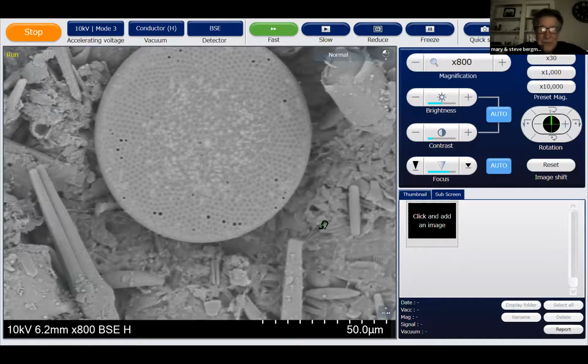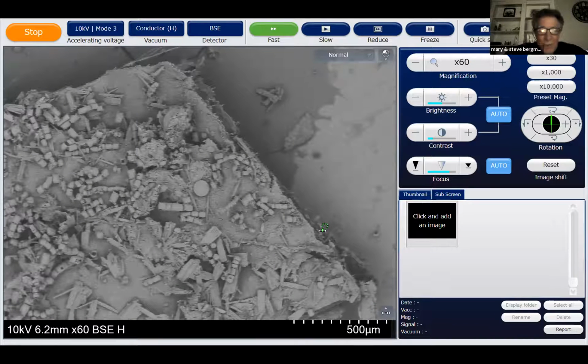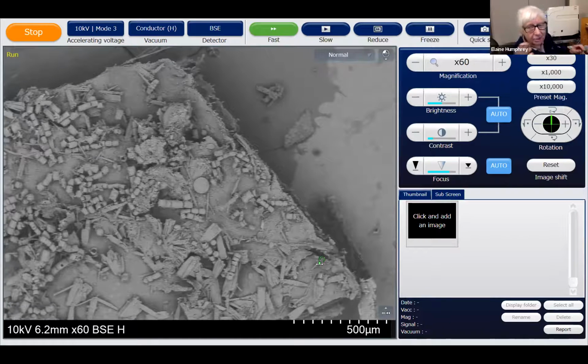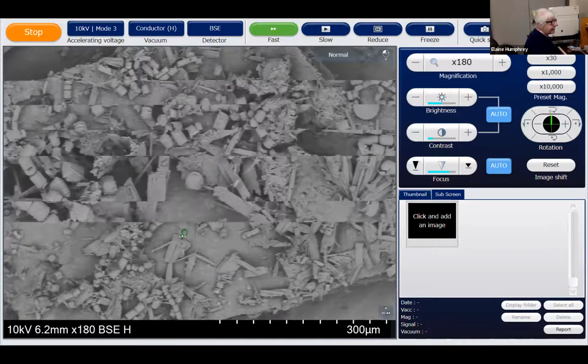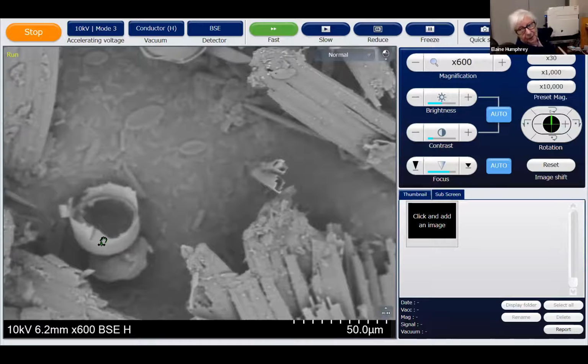Yeah, thanks very much for these great images, Elaine. I'm just wondering about when these diatoms are living, what percent of their body is the skeleton, the silica that we're seeing, and what percent is organics, the living cell stuff? Well, plants tend to have a lot of vacuoles in them, right? Plant cells. Now if we can find a broken one, you'll be able to see how thick the silica is. And it's not very thick. Yeah. See, there's a broken one of the marshmallow kind.